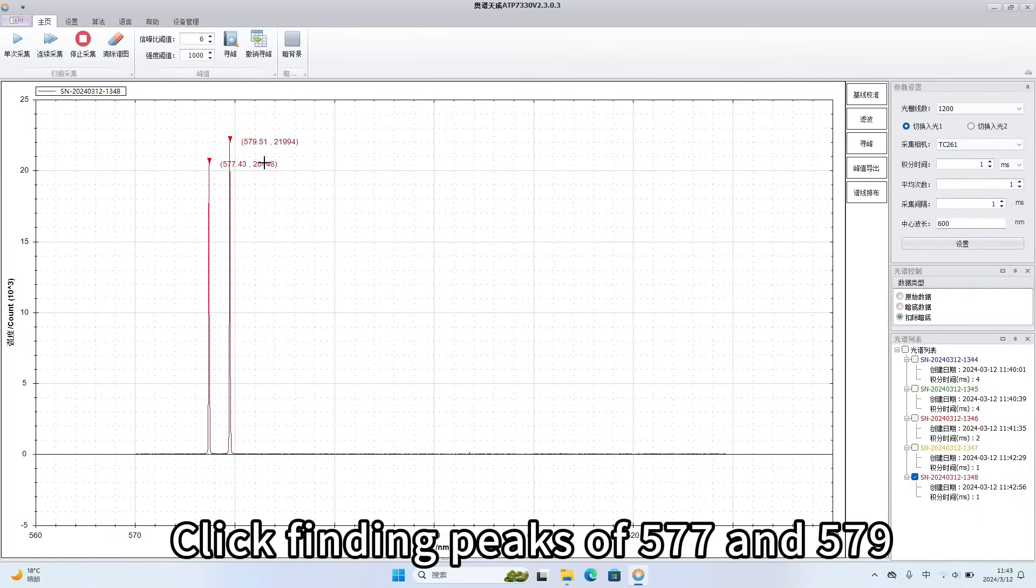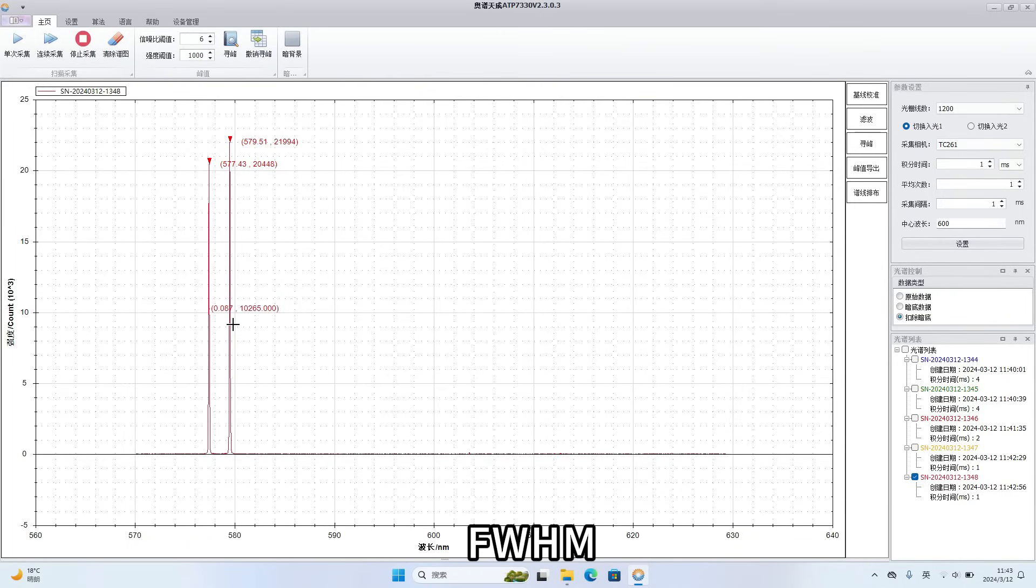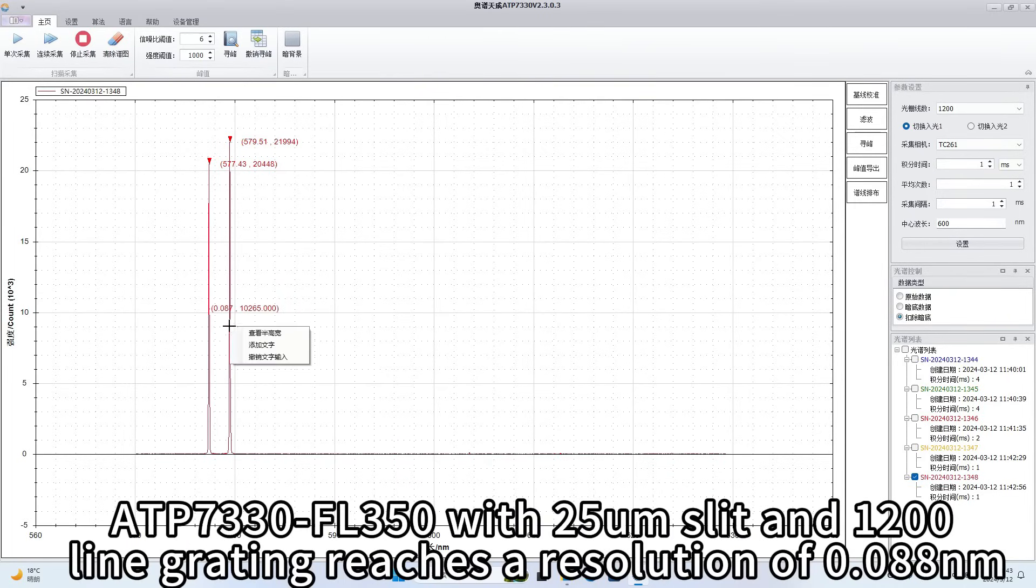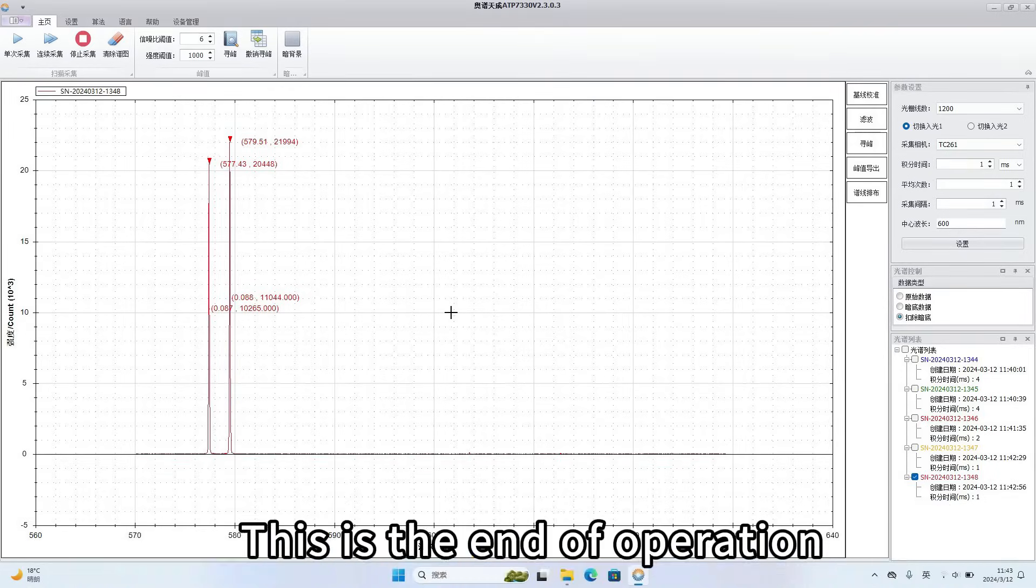Click finding peaks of 577 and 579. Double click. FWHM. ATP7330 with 25 micrometer slit and 1200 line grating reaches a resolution of 0.088 nm.